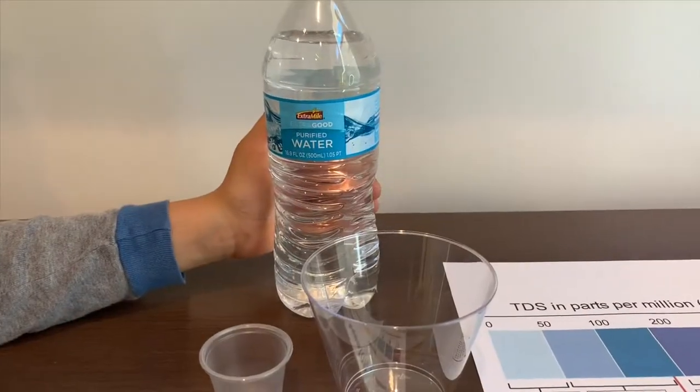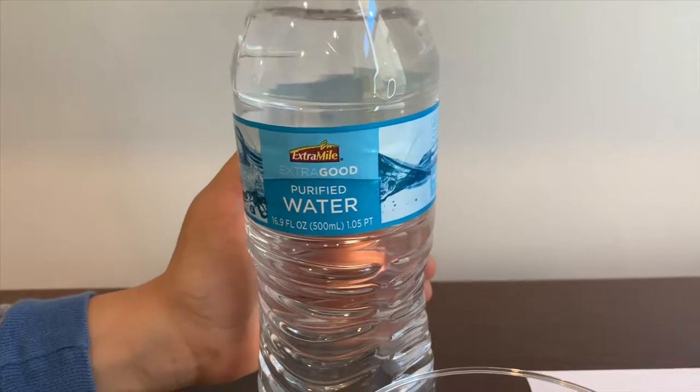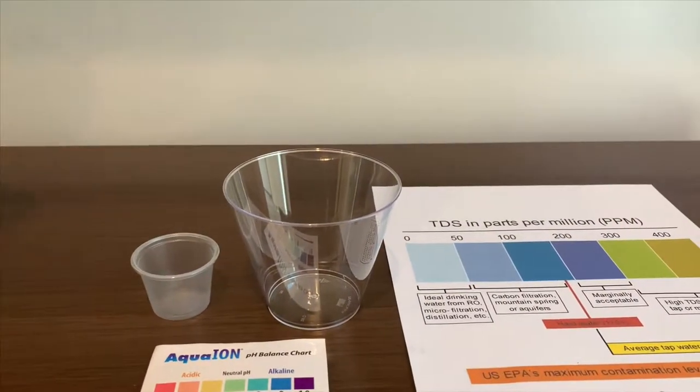This is Extra Mile purified water. It costs $1.29 and it's sold at Extra Mile stores. Let's test the TDS and pH levels. Let's pour some water in.